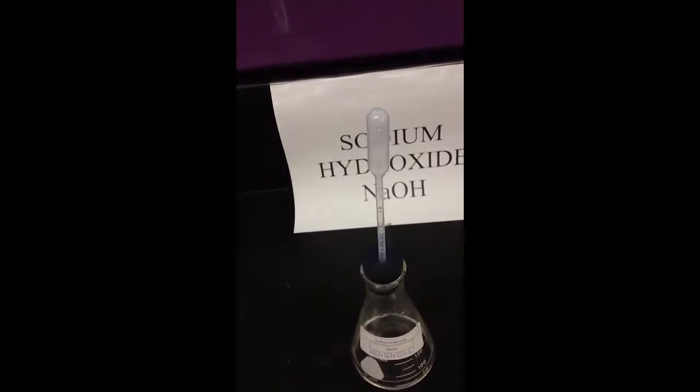And then after that we have an if-then statement. If there's a solid, we'll remove the liquid by dumping it down the sink and take that sample to step 2. If there is no solid, then we'll just continue with those ones to step 3. We want to make sure we're recording which chemicals formed solids and which did not. So right now I'm going to add the 5 drops of NaOH. I double check my sign and make sure that it matches the bottle, which it does. So 5 drops of each one in here.